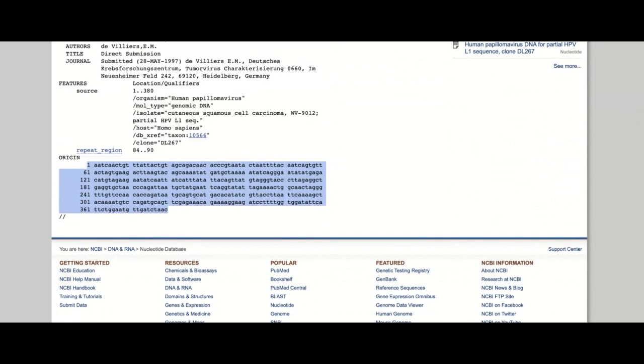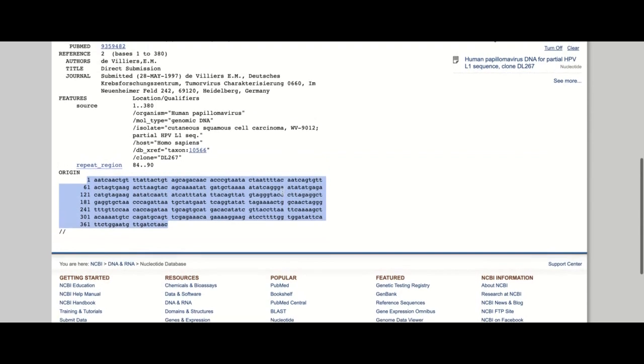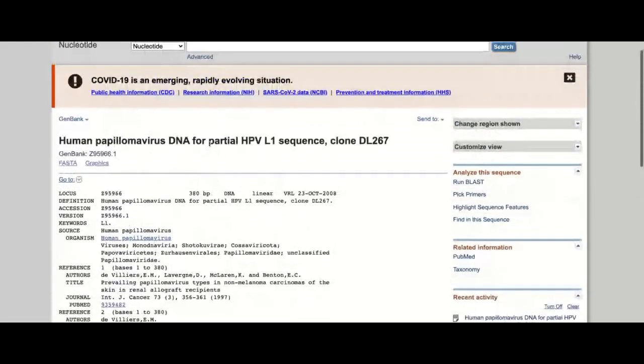So I told you it has to be in FASTA, and I'm actually going to do something that is wrong on purpose. This time for real is on purpose, so that you see what happens if you don't do this right. So you have this sequence for this, that's the first link that I gave you. And then there are 2 other links.